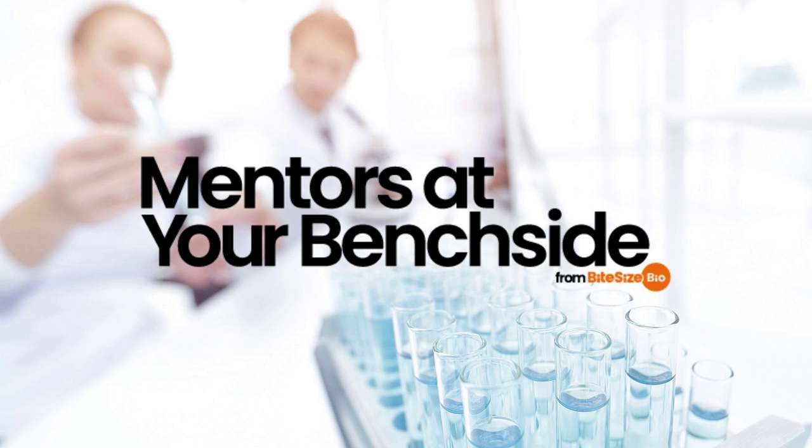And because it relies on copper for the first reaction, the chemicals that react with copper can also interfere with the BCA assay. Number 4, the Folin-Lowry assay. Similar to the BCA assay, this good old-fashioned colorimetric assay also involves 2 steps, one of which is the Biuret reaction. First, it complexes copper with the nitrogen in your protein.